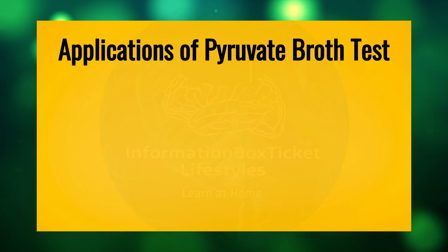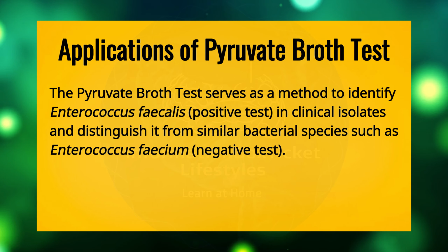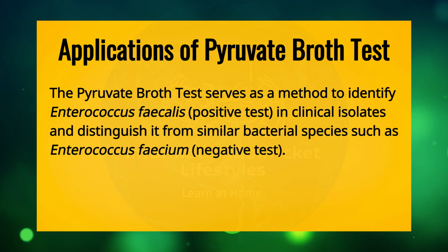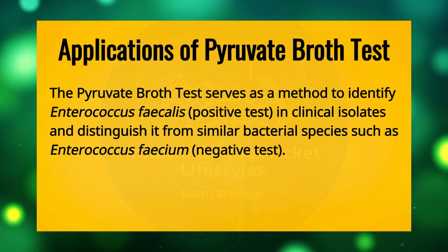Applications of Pyruvate Broth Test. The Pyruvate Broth Test serves as a method to identify Enterococcus faecalis, positive test, in clinical isolates and distinguish it from similar bacterial species such as Enterococcus faecium, negative test.